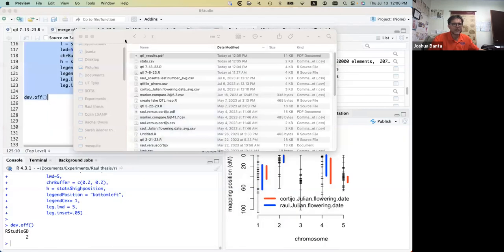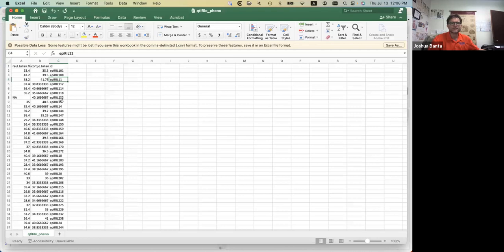So now here's what I'd like you to do for your homework. Also notice that the way I have the script set up, when you're missing data, you just put in capital N, capital A, not applicable. That's the way it knows to read that in as missing data.